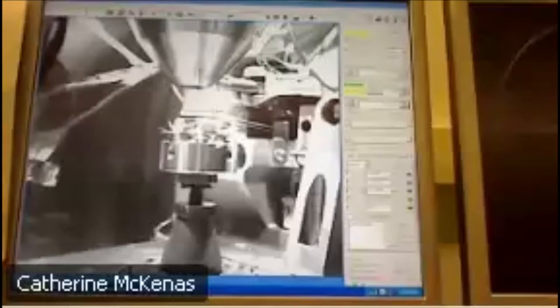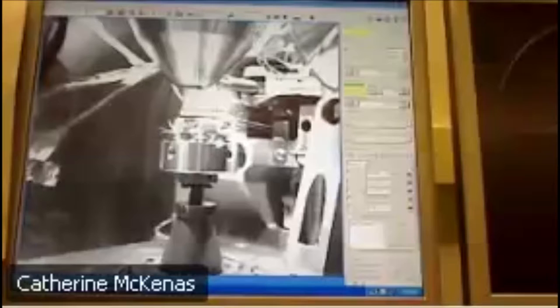But we're using a slightly different microscope today, and it's a lot more high power and better, and Catherine's going to tell you about that and how it's different. Right, so on the left now, y'all should see our light microscope, and we've inverted that image from the previous slide to show you how we're looking at it now. So at the bottom, you have your eye and then the light, like Nicole talked about.